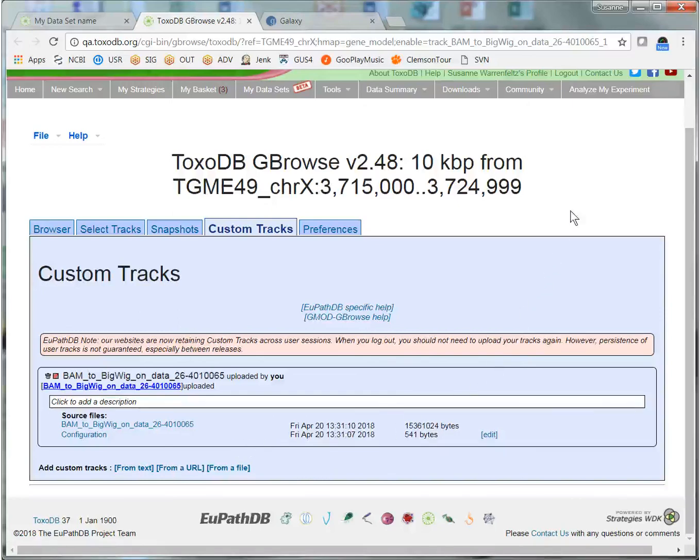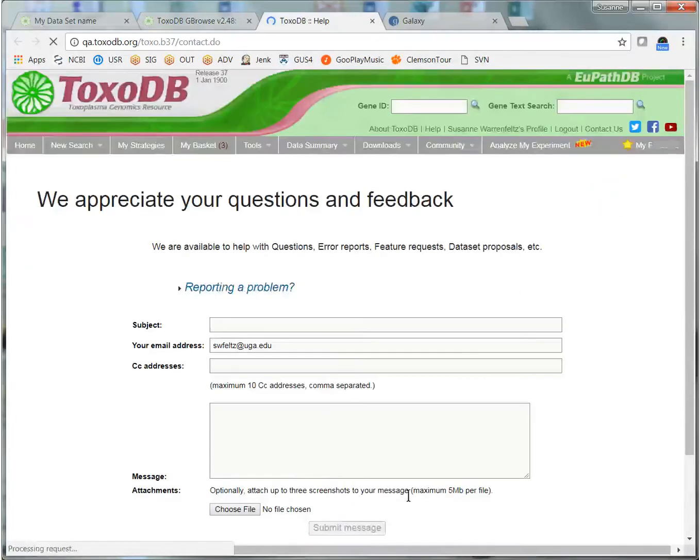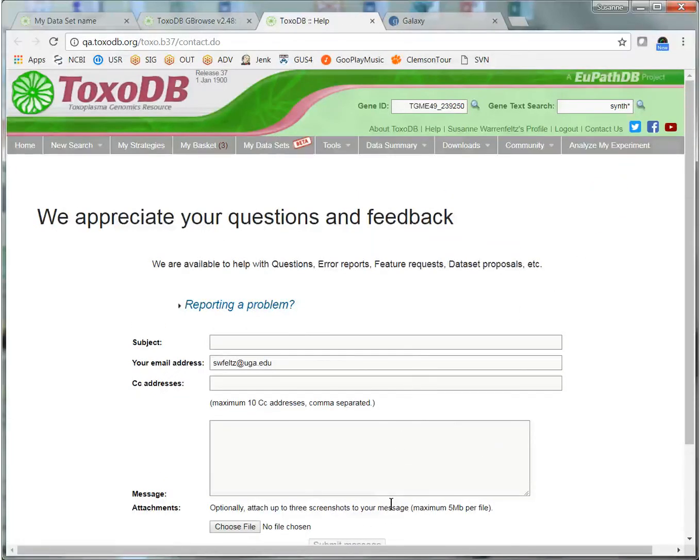And that's the overview of a bigwig export tool. If you have any questions or comments, please click the Contact Us button and send us an email. Thank you.